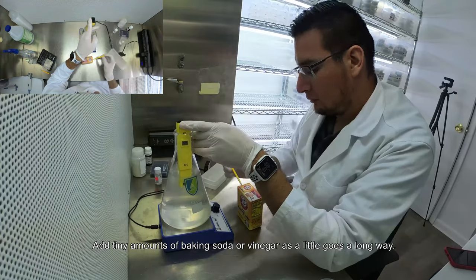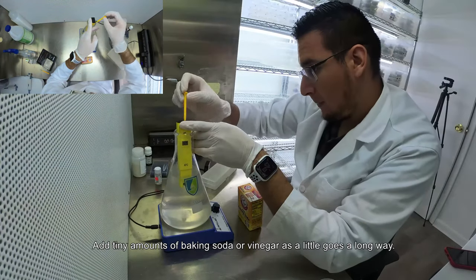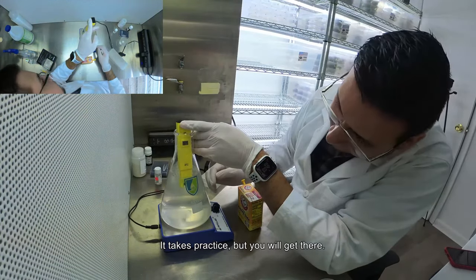Add small amounts of baking soda or vinegar, as a little goes a long way. It takes practice but you will get there.